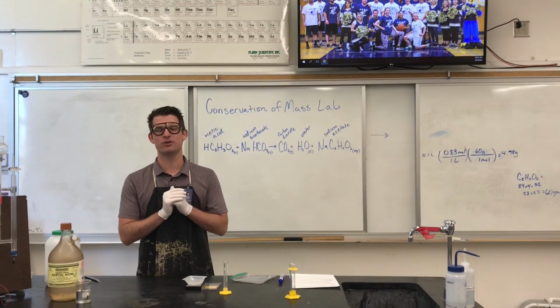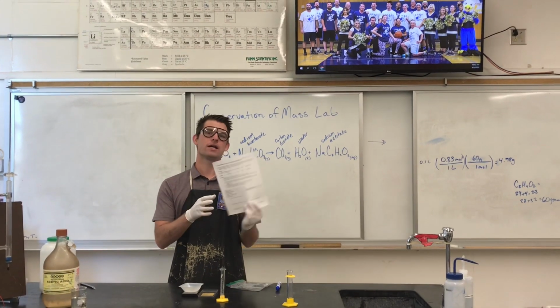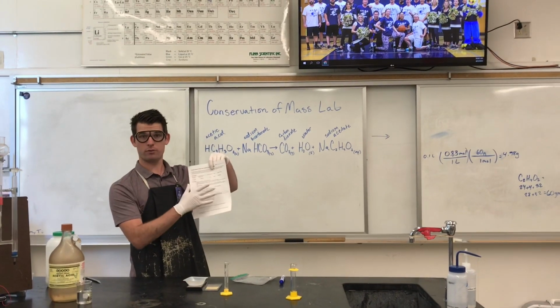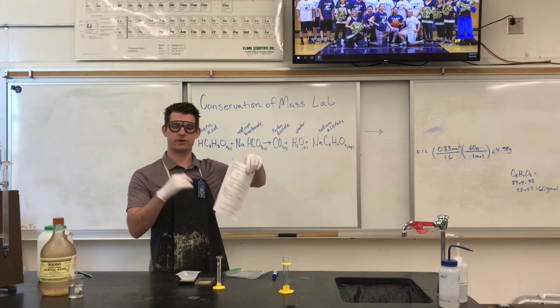Lab today and we're going to do an experiment. I have for you the lab handout linked on the Google site, so make sure you pull that up. I'm going to give you all the data today, so follow with me through the data and then you'll answer the analysis questions by yourself.